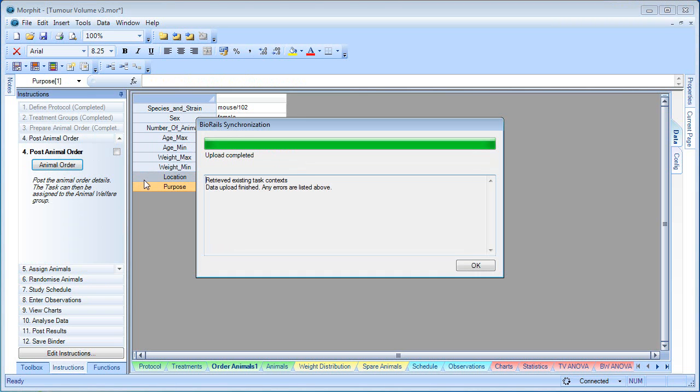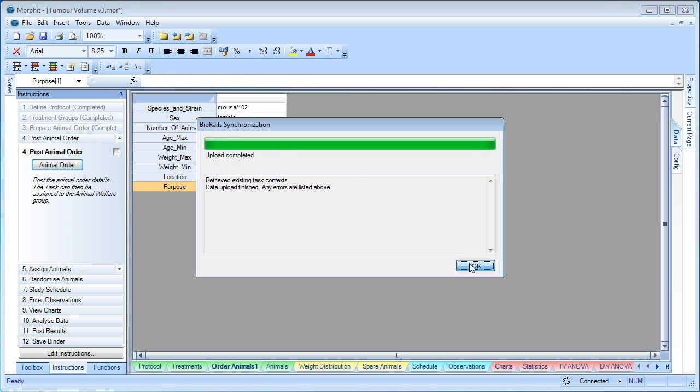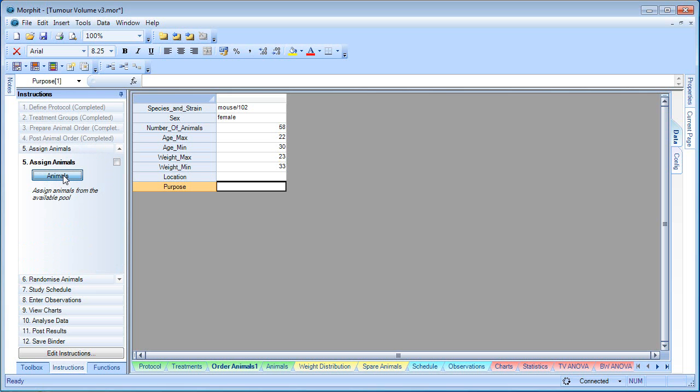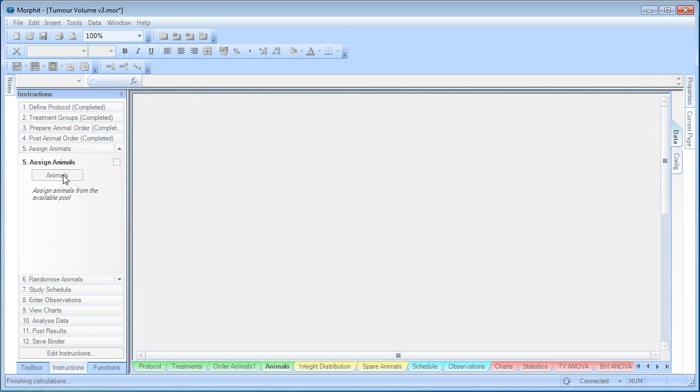What this has done is uploaded the values in this table into a task in BioRails, which I can then reassign to the animal welfare people. Now, when the animals are ready, they will update their database, and I can extract that data out of their database and bring it into this binder.